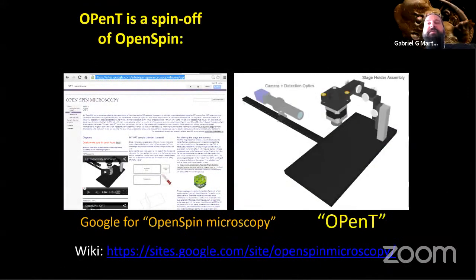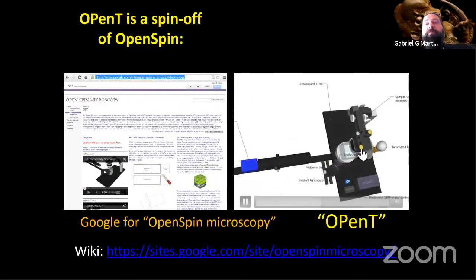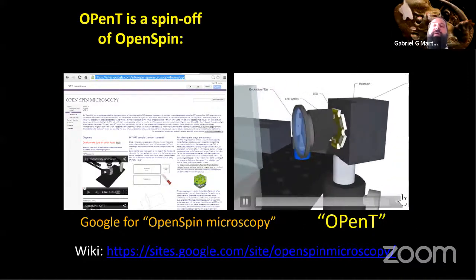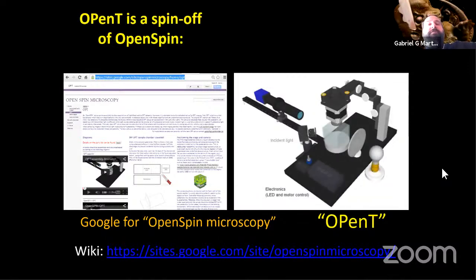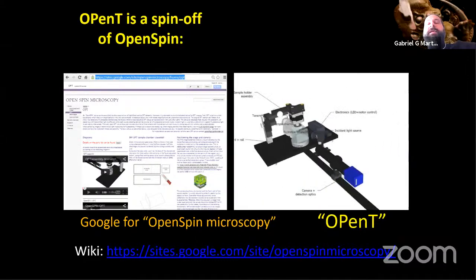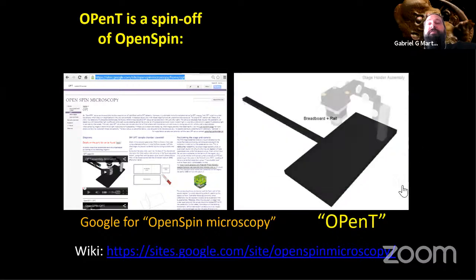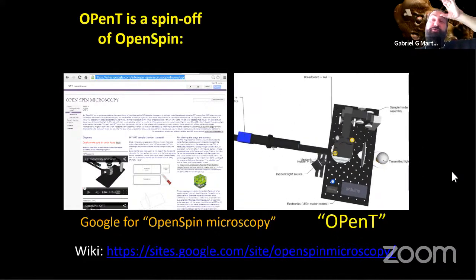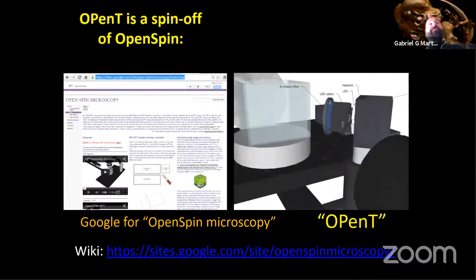It's actually very easy, even much easier than building a light sheet, to build one of these systems. You just need a source of light, a camera, something to hold your sample and a motor to rotate it. And this was one of my pet projects a few years ago. It turns out that it's so inexpensive to build one of these and the quality of the images is so good that we ended up having a lot of success and a lot of fun with this. The recent thing is that we built one with Legos, which I don't have time to show today, but Alexander has built a whole version with Legos, which you can build for less than 500 euros.